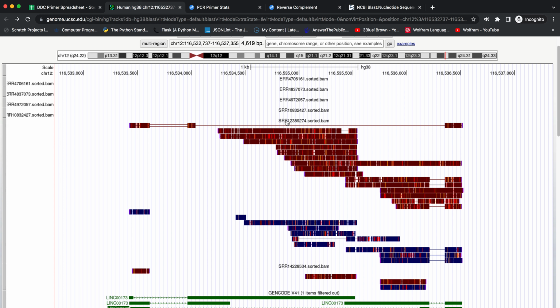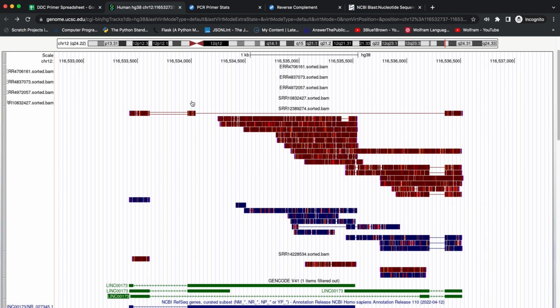So looking back at our large sequence, we designed a forward primer here, and the forward primer is pointed to the right. We're going to amplify an insert that contains this large splice site. So we have sequence on the other exon that is over here to the right. You can see here that this space is approximately 1 kilobase. And so when you look at this sequence, there's certainly no way that it's 1 kilobase. The whole sequence, in fact, is only about 450 base pairs long.